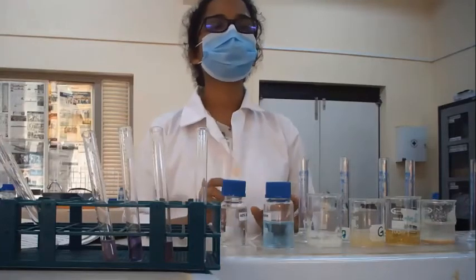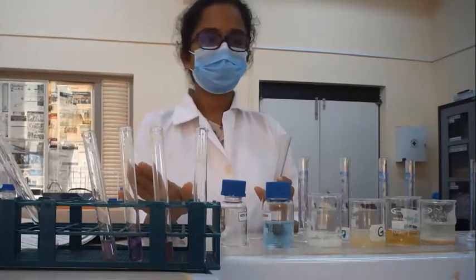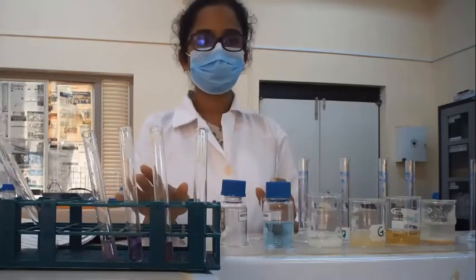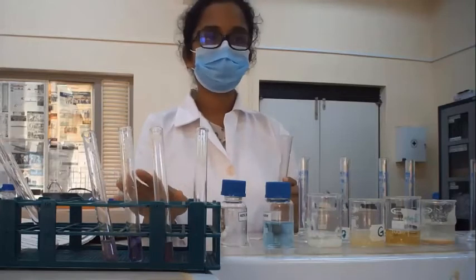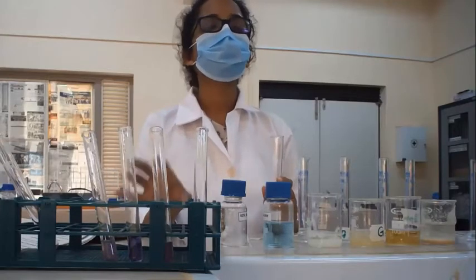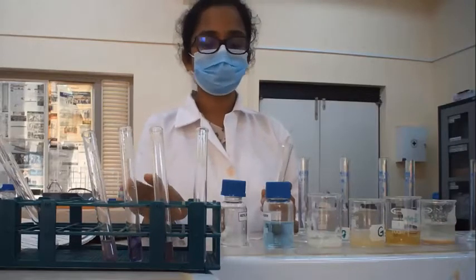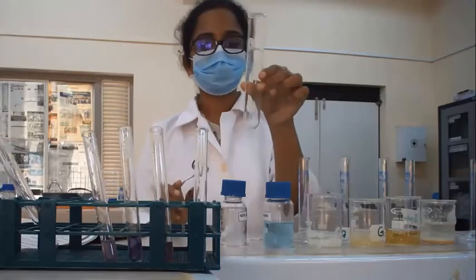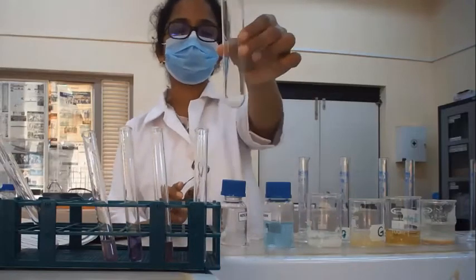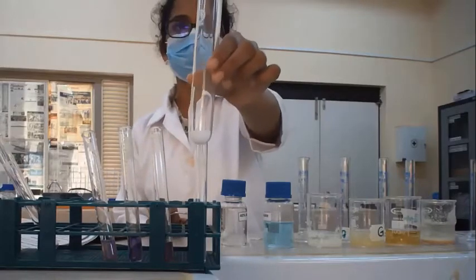I told you that there is a limitation of this test. That means this test gives a color change for any compound having a biuret group. Let's see this using a urea sample. I have taken a few crystals of urea into a boiling tube, and now I am going to heat it.